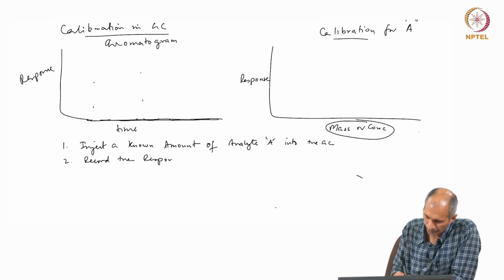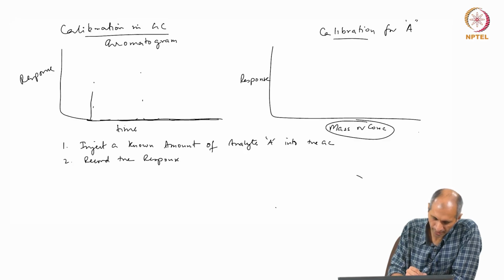So, I inject A, and I record the response. Let us call this mass 1 or concentration 1, level 1 concentration.